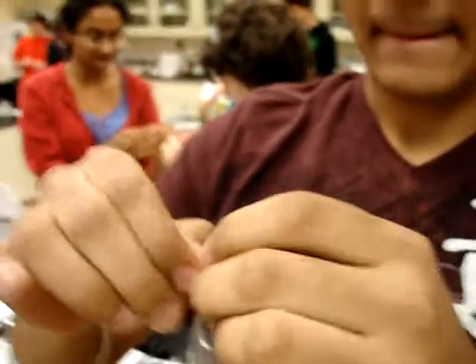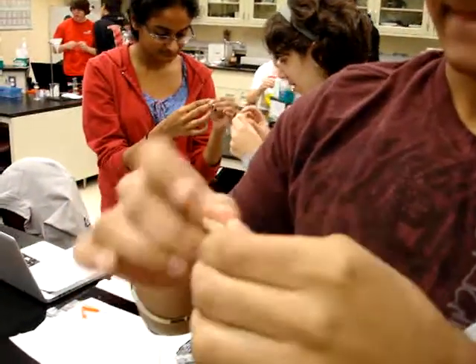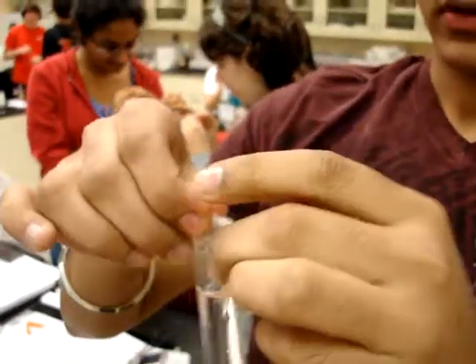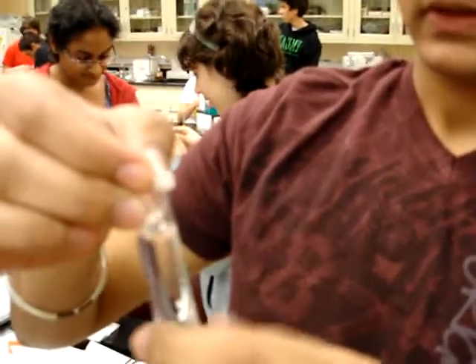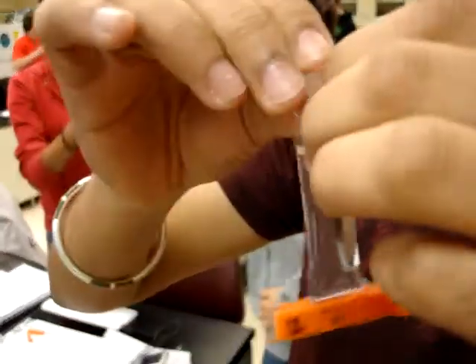You're going to roll it up. We don't want any air bubbles in there. Open one at a time, fill it, then let it sit. Make sure you get as much of the solution as possible for the most accurate results. Make sure you rinse out your beaker after each time.